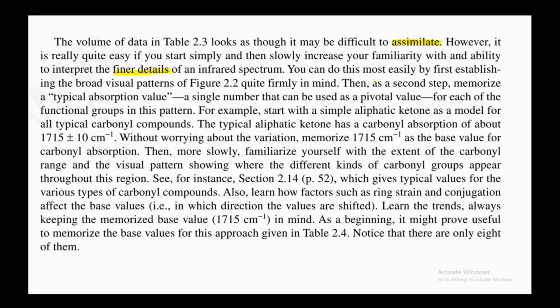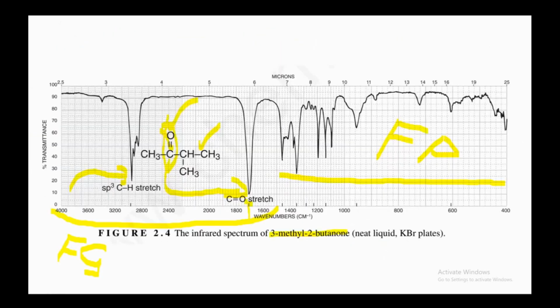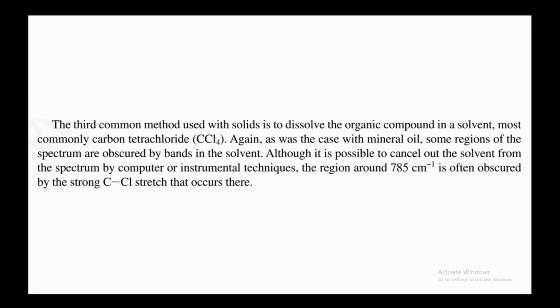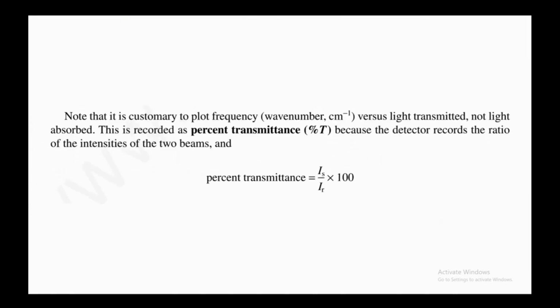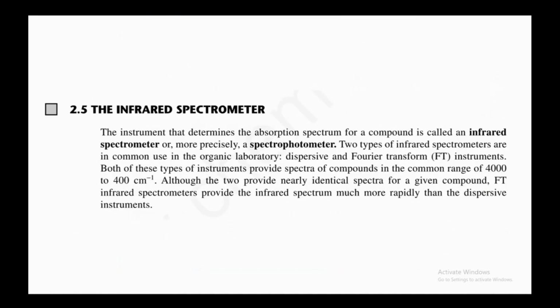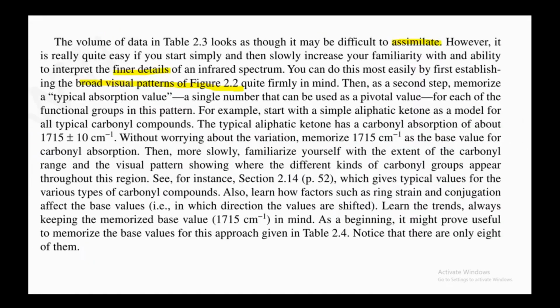You can do this most easily by first establishing the broad visual pattern of Figure 2.2. That is Figure 2.2. Keep Figure 2.2 quite firmly in mind.